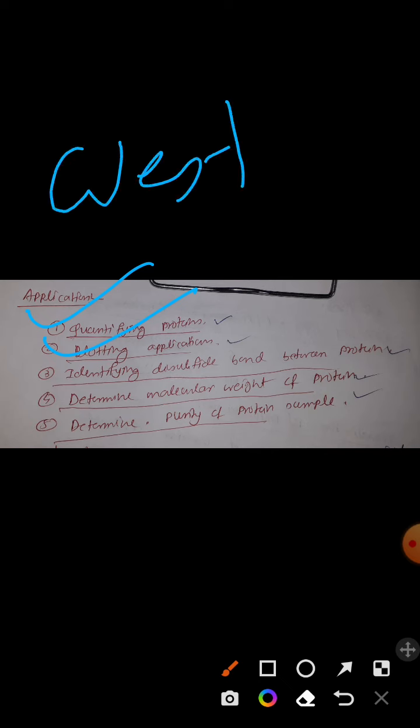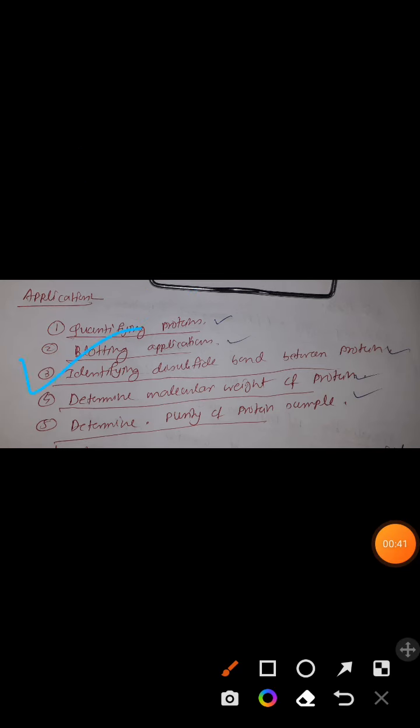Application: we can quantify protein, and we can use this in blotting applications. Remember that SDS-PAGE is widely used in the Western blotting technique. Identifying disulfide bonds in protein, determining the molecular weight of the protein, determining the purity of the protein sample. So we can determine the molecular weight, the purity of the protein, and the number of disulfide bonds between proteins. Blotting application and quantifying protein purposes, SDS-PAGE can be used.